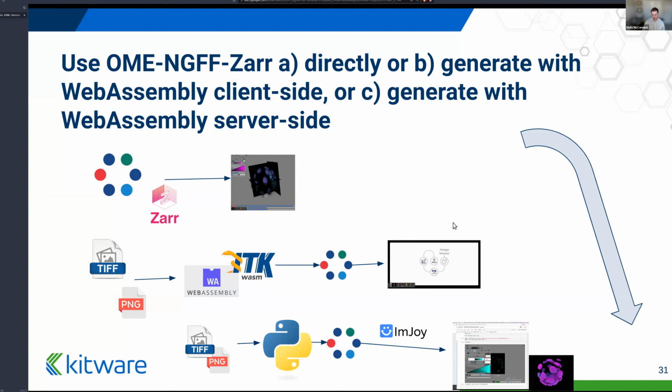Or if they want to go further and they want to work with server-side resources, they can do the same with Python on a server and use some specialized compute resources for doing some further investigation, working with your other software tools, your other data sets, doing more advanced analysis, and being able to, in the end, get this custom exploration of the data with all the compute resources that you have available, is the idea.